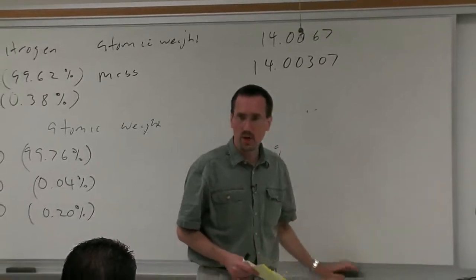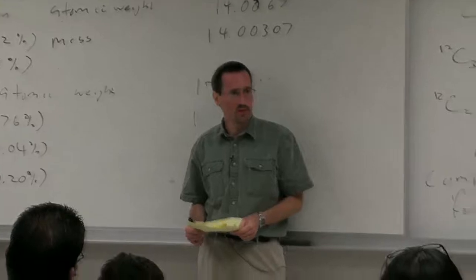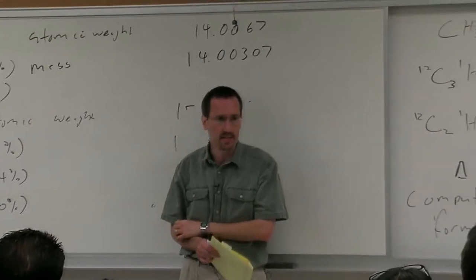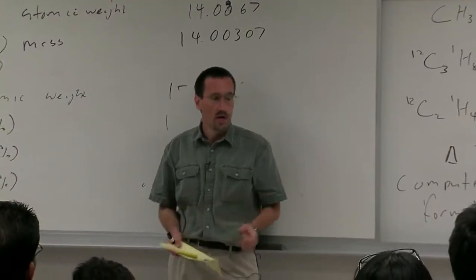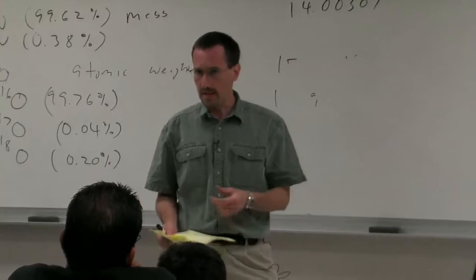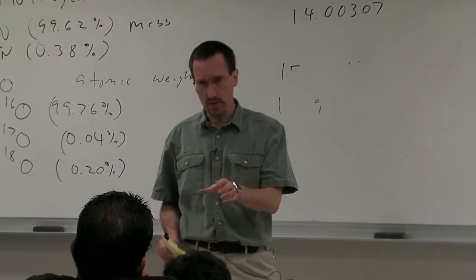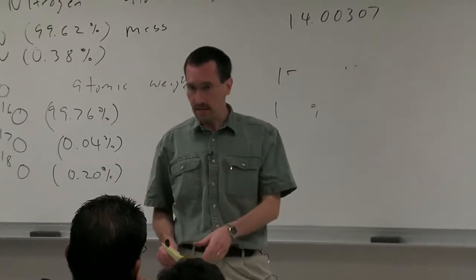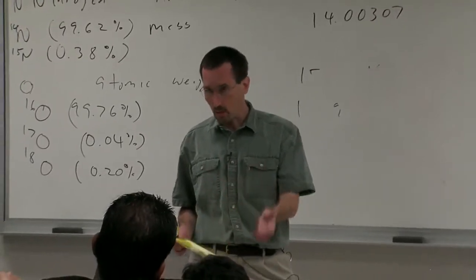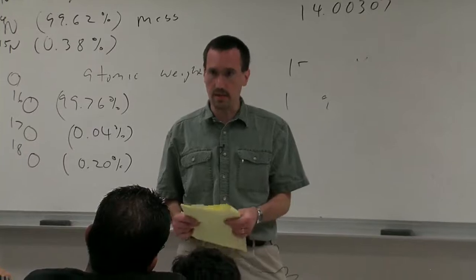Beautiful question. Well, you're in EI, so the question was, if you're doing positive ions, do you need to worry about adding the exact mass of sodium? Of course, EI mass spec also gives you positive ions, but there you don't add a sodium or a proton. But in the case of electrospray, you probably do have a sodium or a proton or a potassium on there.